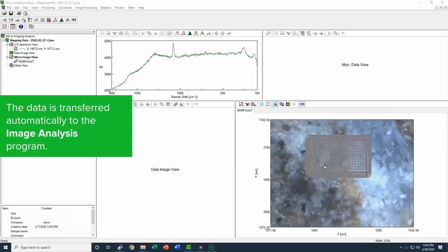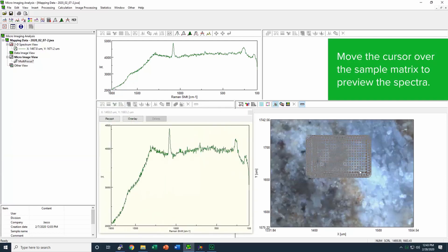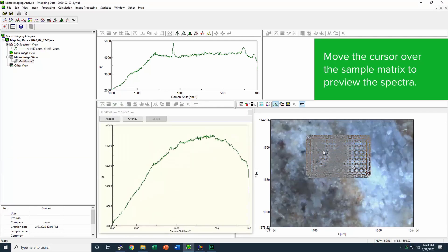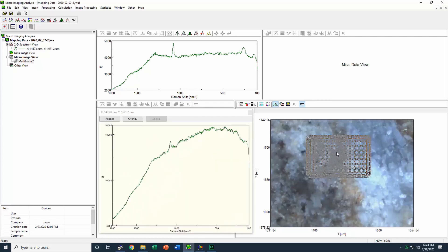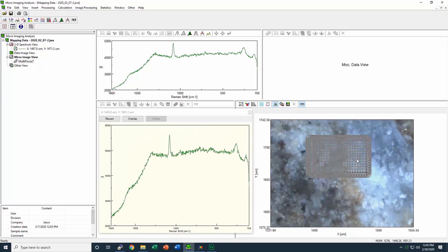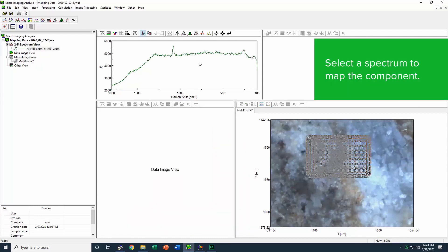The data is transferred in real time to mapping image analysis. In the bottom right screen is the all-in-focus image of the sample with the measurement matrix laid over the top. As we move the cursor over the measurement matrix, we can see the spectra update in real time.